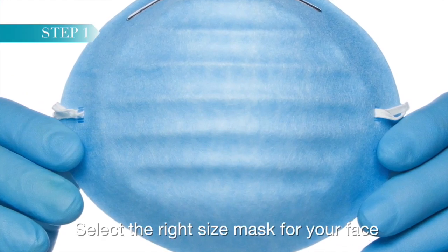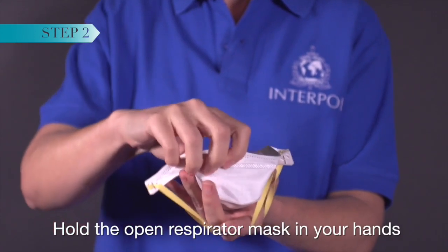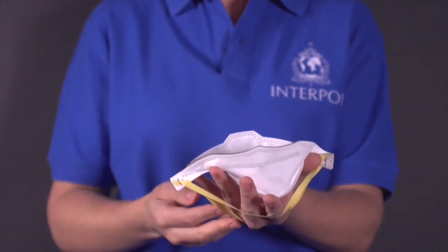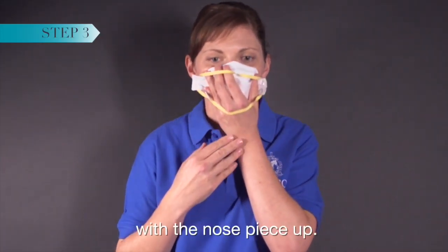Select the right size mask for your face. Hold the open respirator mask in your hands with the nose piece at your fingertips. Hold the respirator under your chin with the nose piece up.